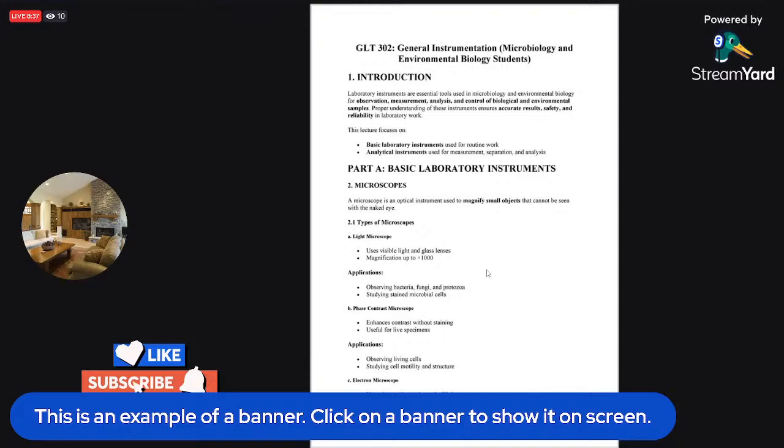It is used for observing bacteria, fungi, and protozoa. And we can also make use of it to see some dyes, how an object appears under stains. So the second one is the phase contrast microscope.